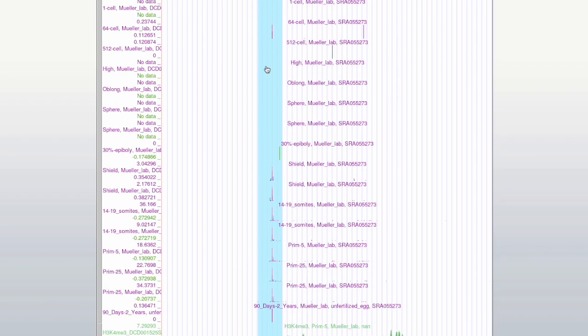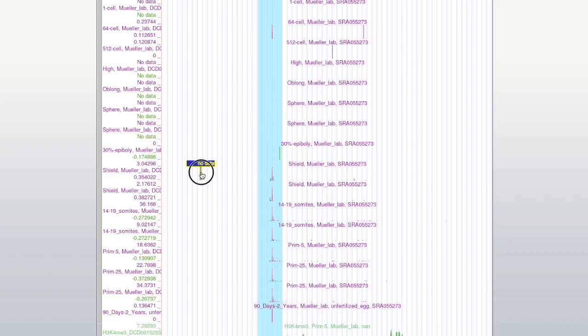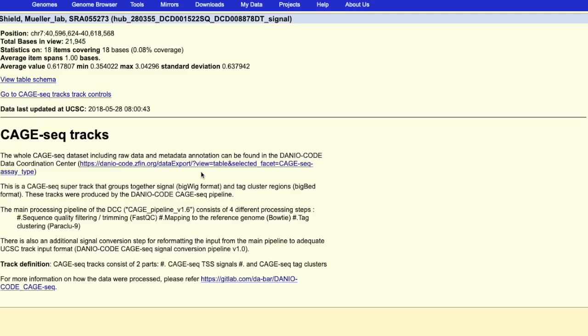If you want to continue your analysis with the CAGE data, you can simply click on the track. And then click on the link to be forwarded to the DanioCode data export page.